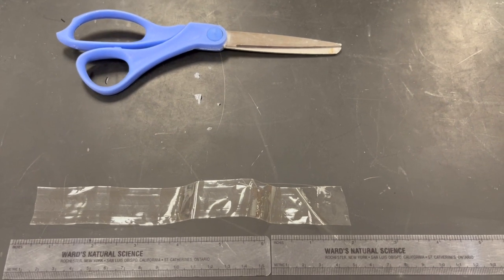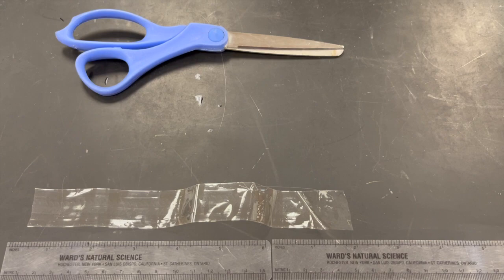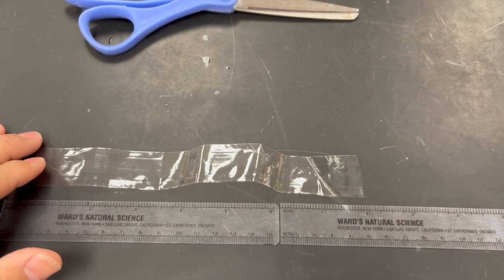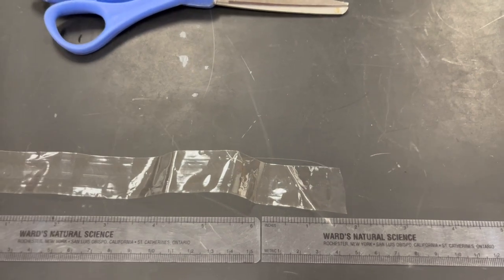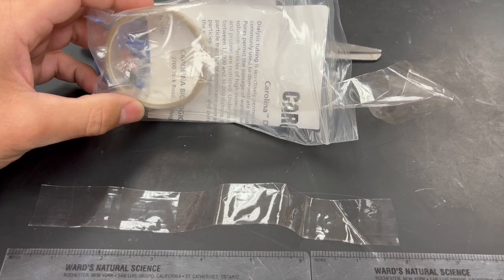Okay guys, so this is the experiment for the dialysis tubing, and what we're investigating here is osmosis. One of the first things you're going to do is cut the dialysis tubing bags. It comes like this, so you just want to cut it into about 8 inch strips.